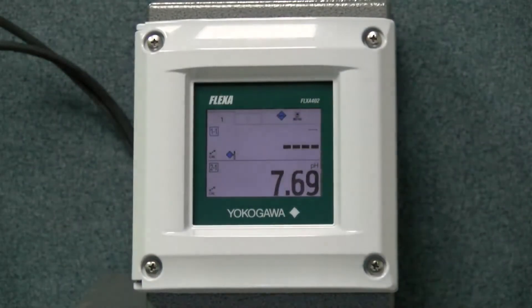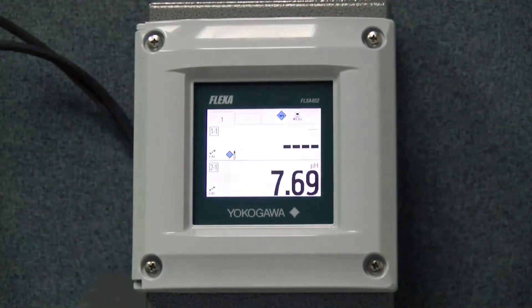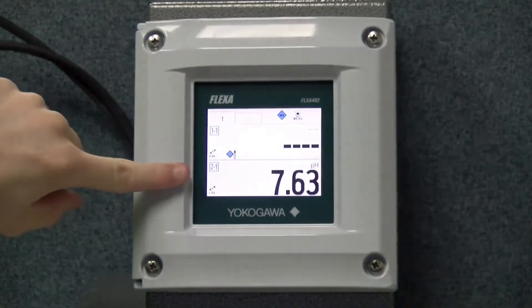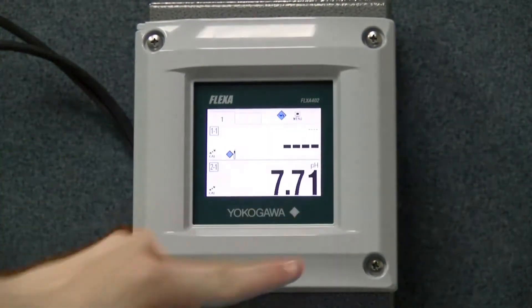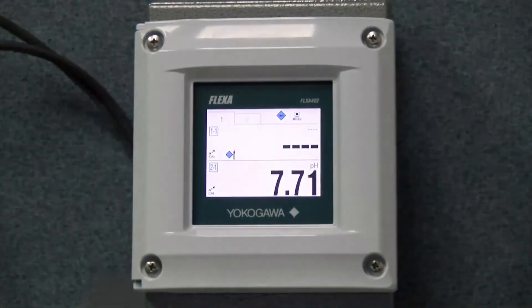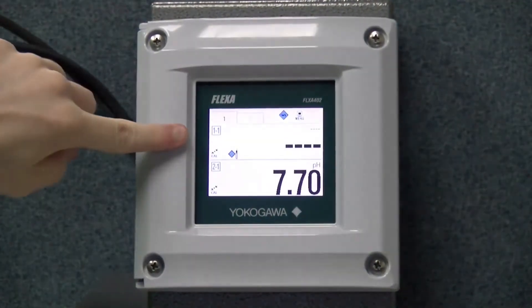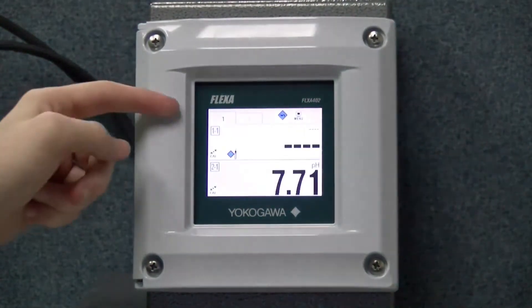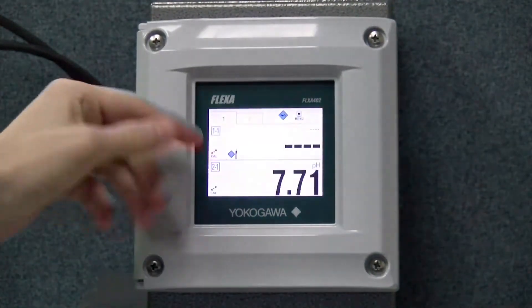Alright, I have now powered on the Flexa, and as you can see, the second module slot has the pH reading in as the sensor is correctly wired. And as you can see, there is no device in the first module, which is why it is showing an error there and the screen is blinking.